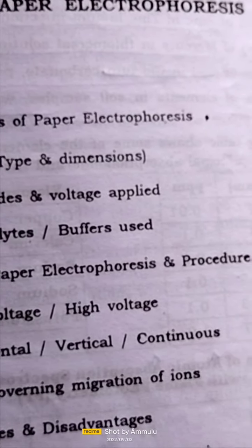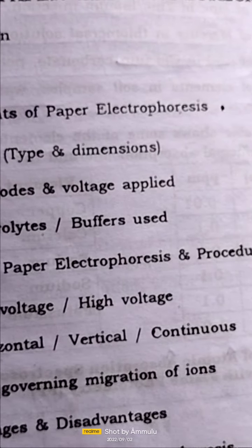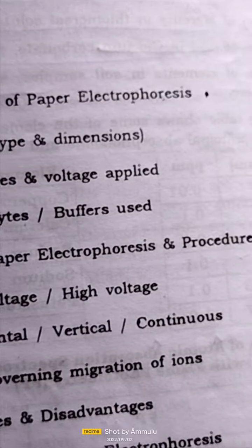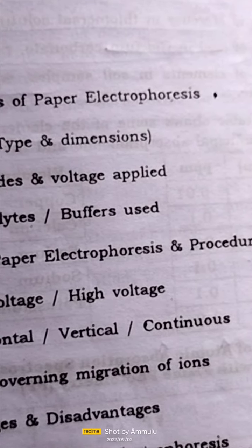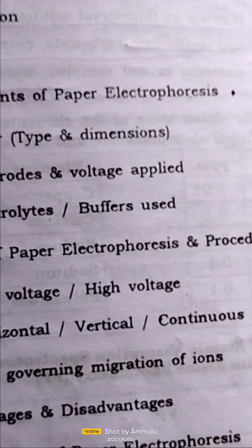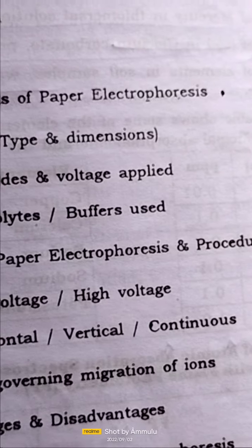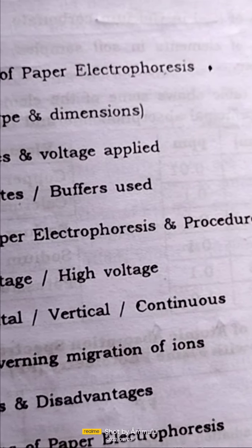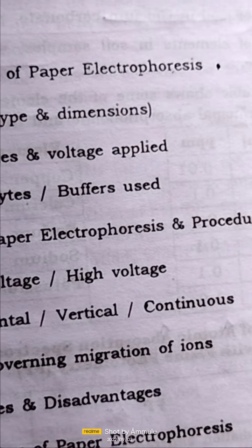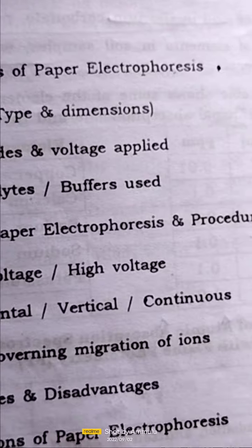Paper electrophoresis is a separation technique. This is also one type of separation technique where ions of different charges are separated on a medium of paper. When we apply a voltage between two electrodes which are in contact with the paper, the ions get separated by their affinity. That will be observed in this paper electrophoresis technique.